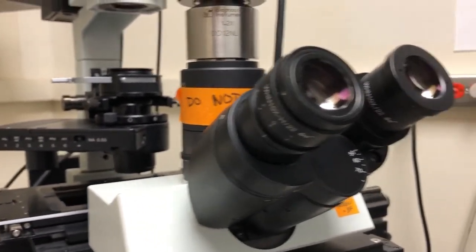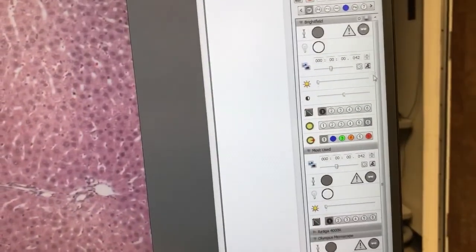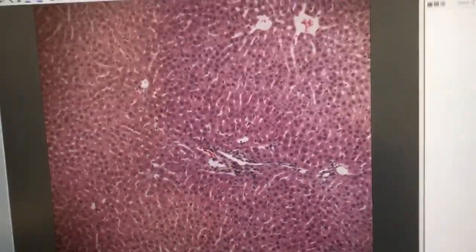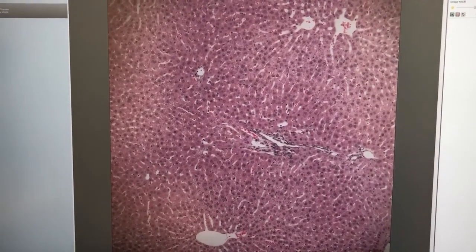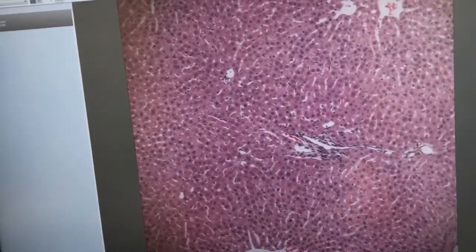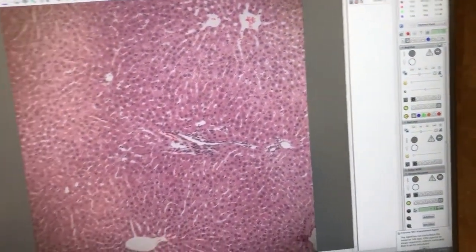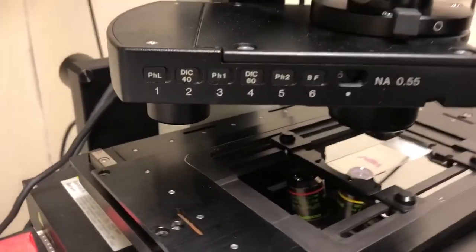Now let's go over how to take an image. Once we've done the Kohler illumination, we can reset the auto exposure to make sure the image looks good. Just like on the BX61, it's a very good idea to take a blank image without the slide in the field of view, because as you can see, there are some imperfections — the middle looks brighter than the edges, and there are some slight imperfections in the light path. To take a blank image, we're going to move completely off the slide.